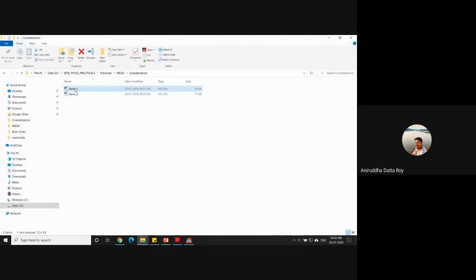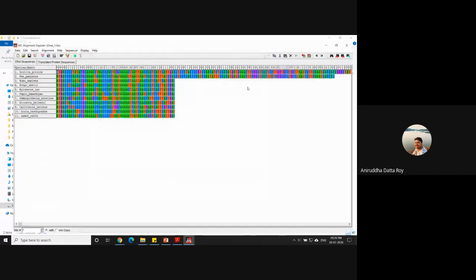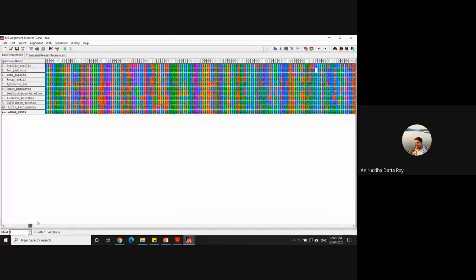and I open gene 1. I open this, I go right at the end, and I click on this particular space on the last, and I paste my data, which is Control V, right? One thing that you have to make sure is to know where your second gene starts from.